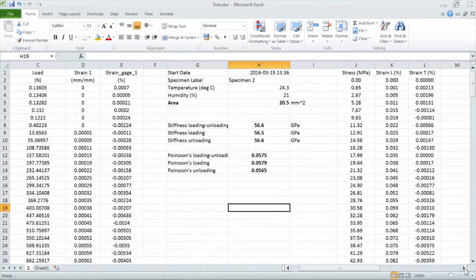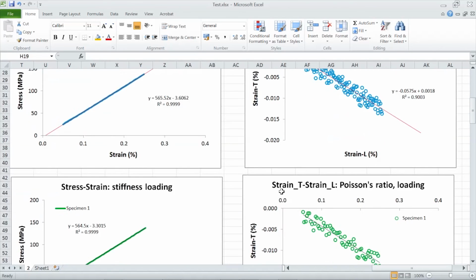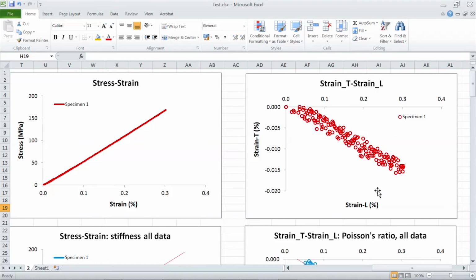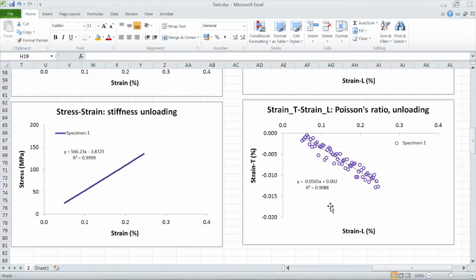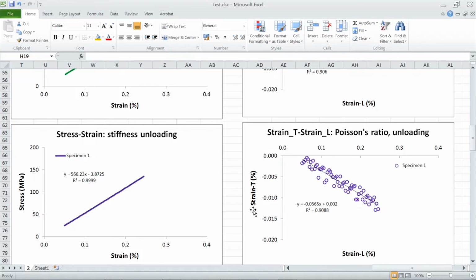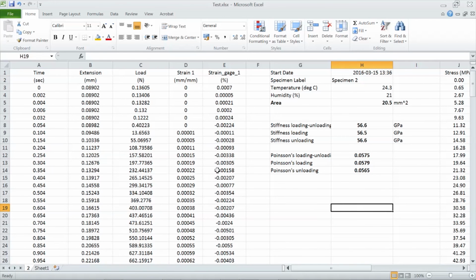Like I said, it's up to you what the layout of your sheet is, but this is how I usually do it. It works fine, and I like to have graphs like this. If something is suspicious, I can always go back and look at it and decide what was wrong. Just really remember, when you copy sheets to process different samples, use one sheet as a template. You copy new data and you update your results. That's very important. Well, good luck, and that's all for now.